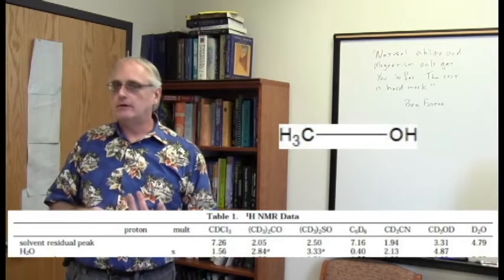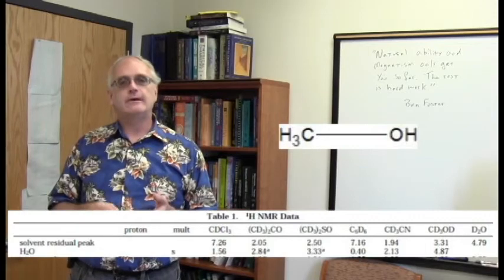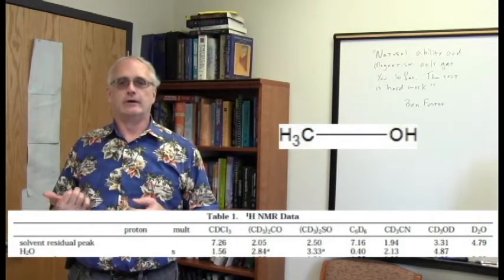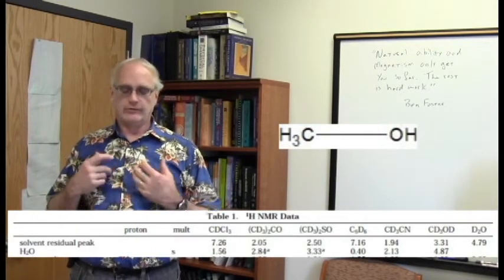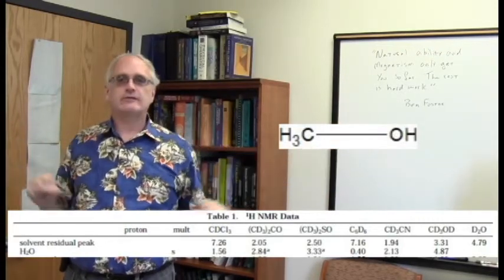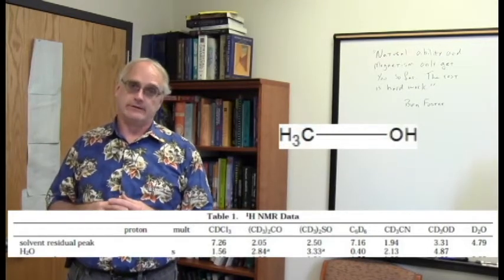Here the chemical shift is all the way down to almost 5 ppm. Same water molecule, but now appearing at 5 ppm. The surroundings of the water molecule, methanol, strongly polar, hydrogen bonding, those hydrogens on water are now being pulled quite a ways away from the oxygen atom itself and rendering them quite highly de-shielded.